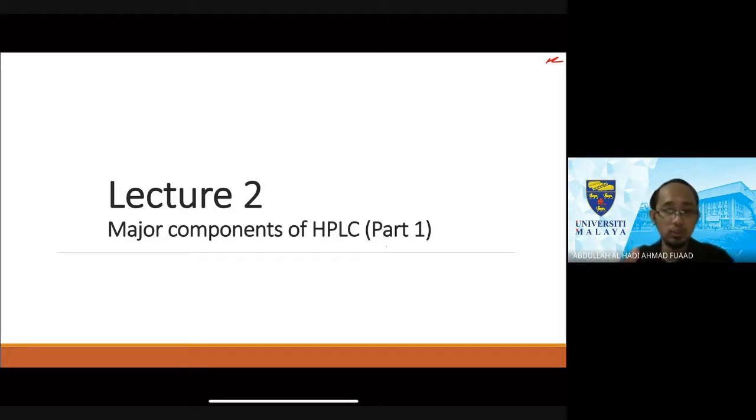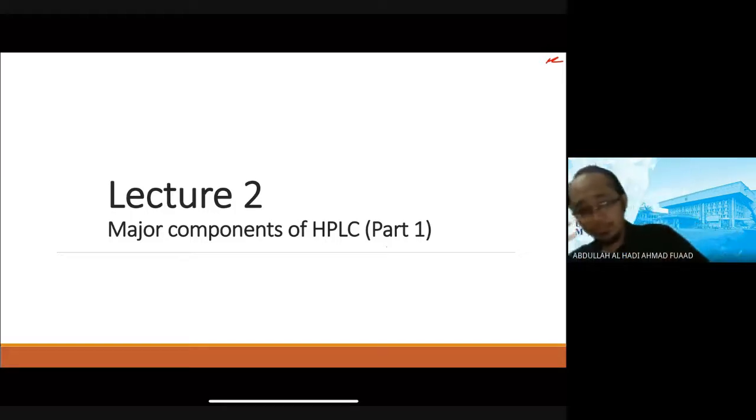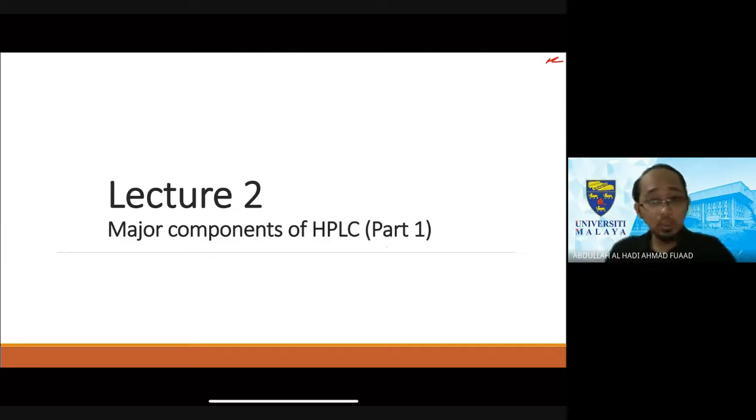I will change the lecture notes to cater to the most requested detector. Otherwise, because of this one feedback that I received, I will just follow whatever is requested, which is, if I'm not mistaken, UV-Vis and mass spectrometry. So if you want to learn about something else, for example, if the company that you work at has an ELSD and you want to understand the principle behind the ELSD, then let me know. Then we can cover the column and the detector.